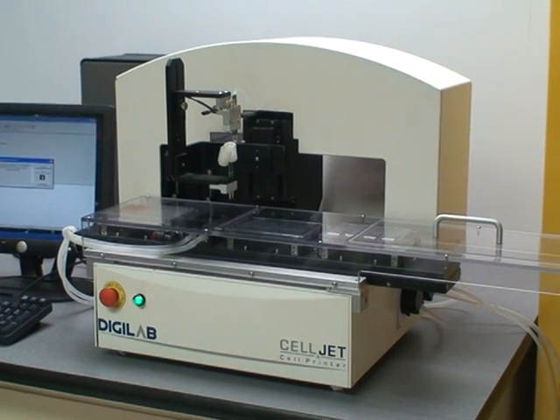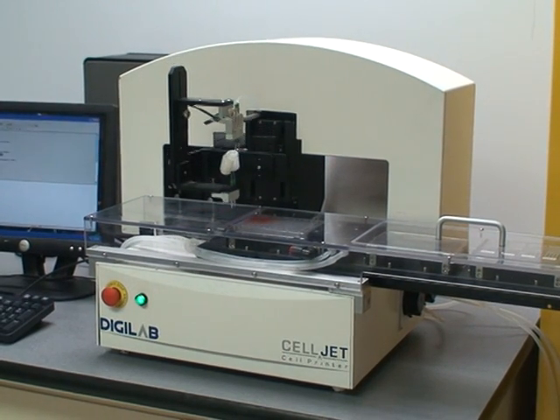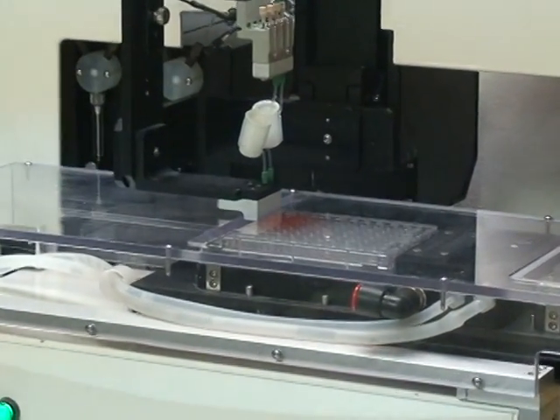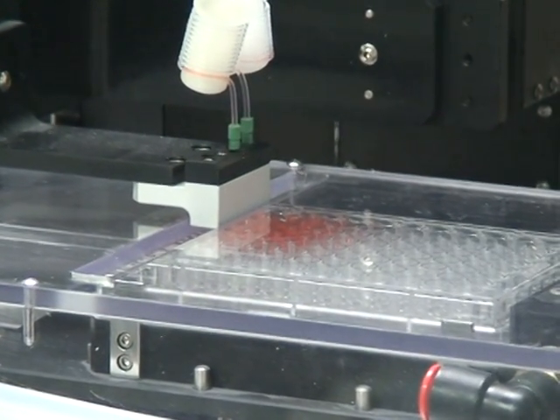Today we're talking about DigiLab's new CellJet, which is a small footprint liquid handler specifically designed using DigiLab's proprietary Synquad technology, which employs a syringe pump and microsolenoid valves to accomplish non-contact dispensing.